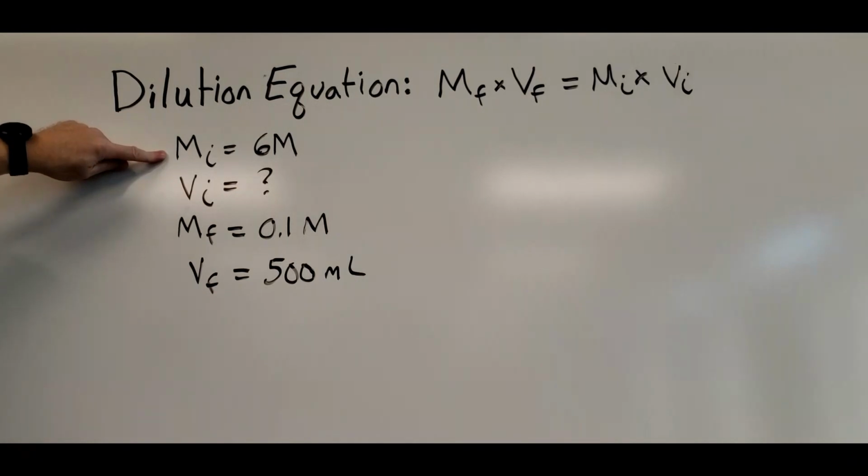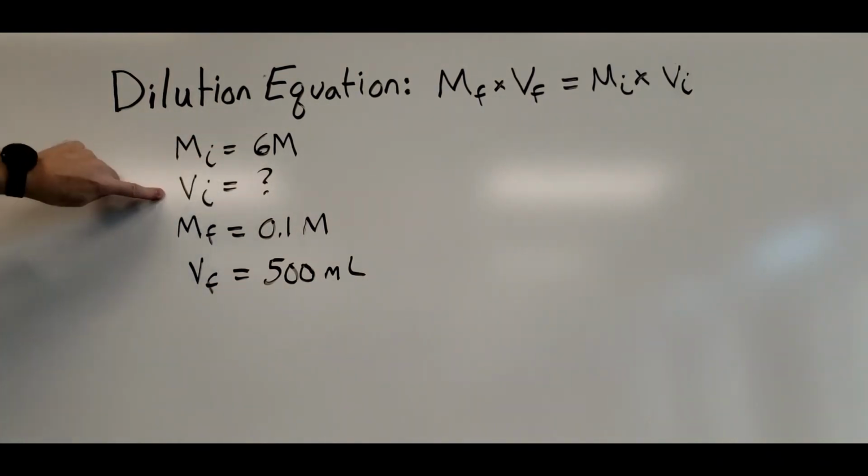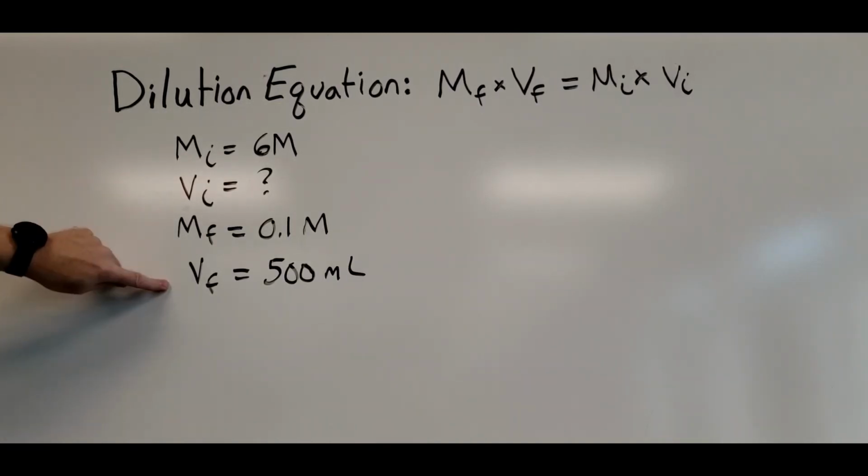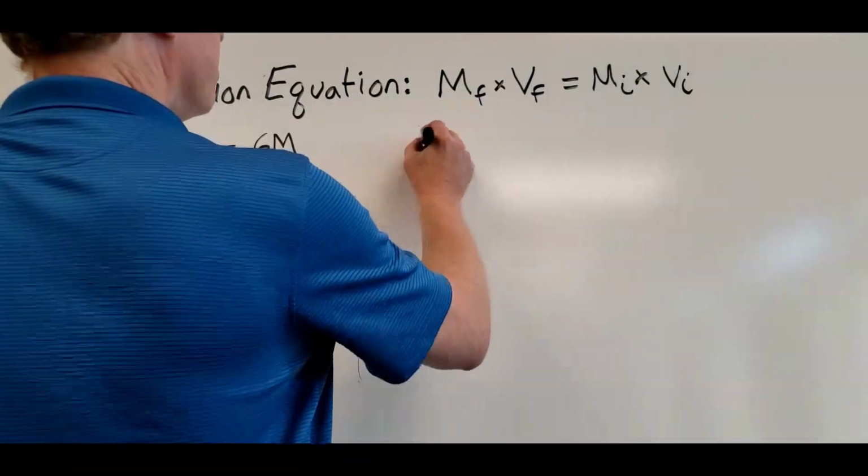We have the initial concentration is 6 molar. We don't know how much we're going to use yet. That's what we've got to figure out. And then we want a final concentration of 0.1 and a final volume of 500 mils. So we'll put everything in.